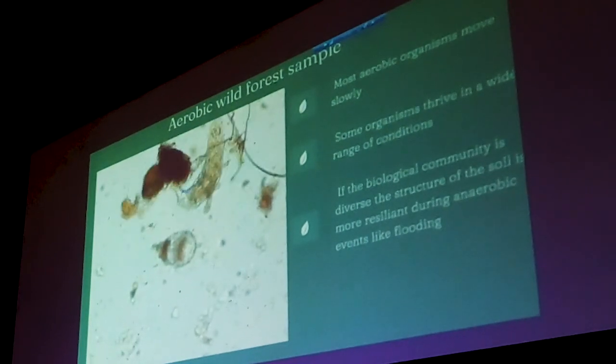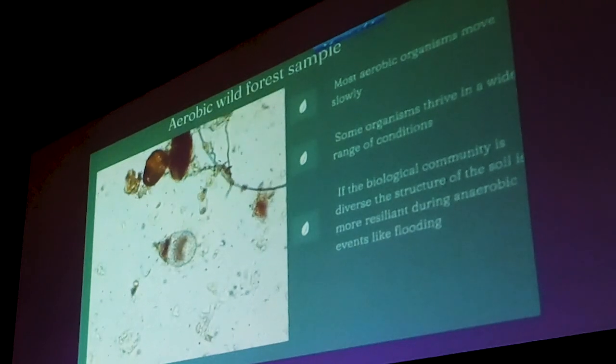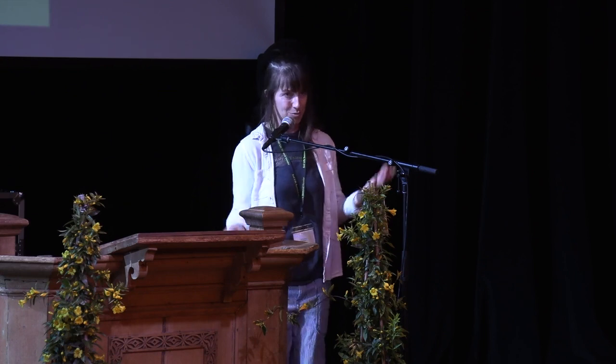As you work with a microscope, and if you practice and play around with it a lot, I like to drive my samples anaerobic just to see what happens. And when you see a massive diversity of aerobic life, when you drive that sample anaerobic, you're going to see the same diversity on the other side. So as you grow your aerobes, you grow your anaerobes. It's just the way that the system works.